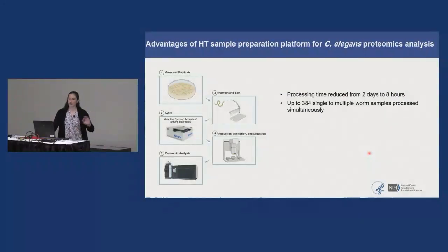And so at this point, our pipeline is capable of processing these C. elegans samples. We have reduced the overall processing time from 2 days to 8 hours. We're able to process up to 384 single to multiple worm samples simultaneously.